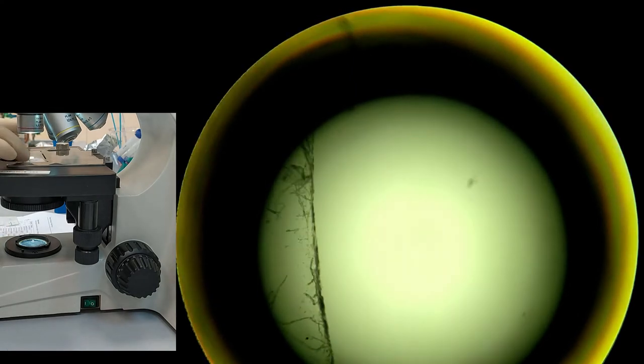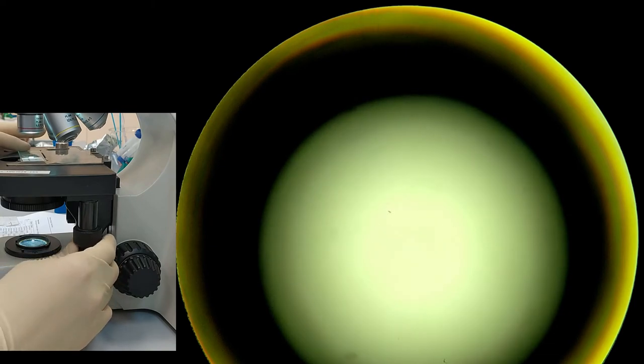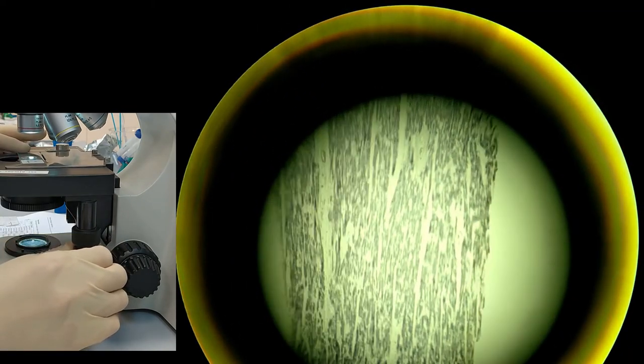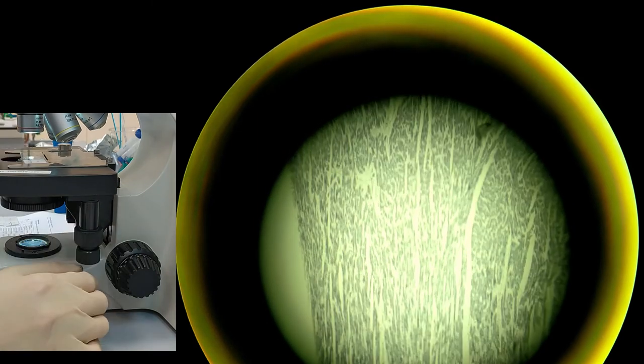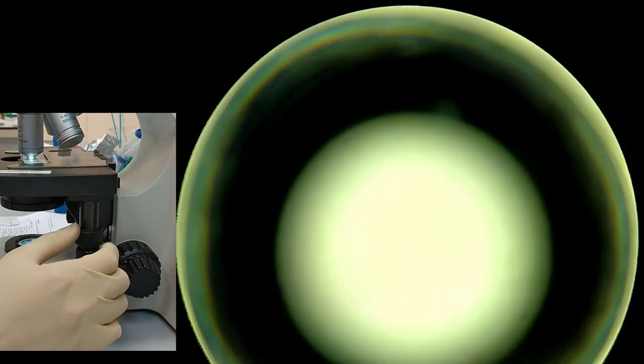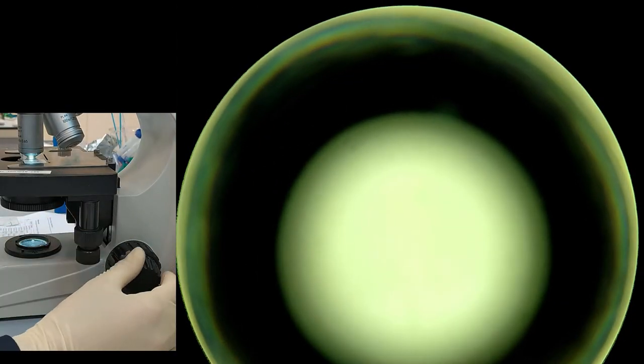Next, we have the section of your heart. These are fibers of your heart muscle, and these are the smooth muscles.